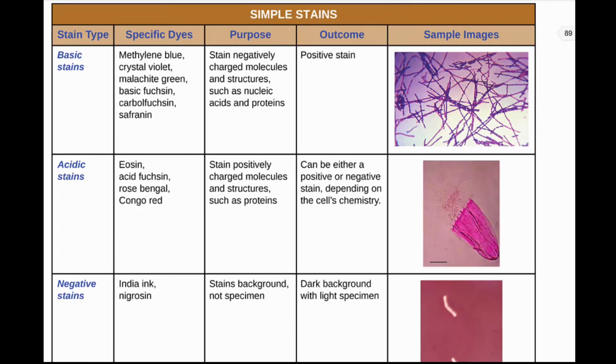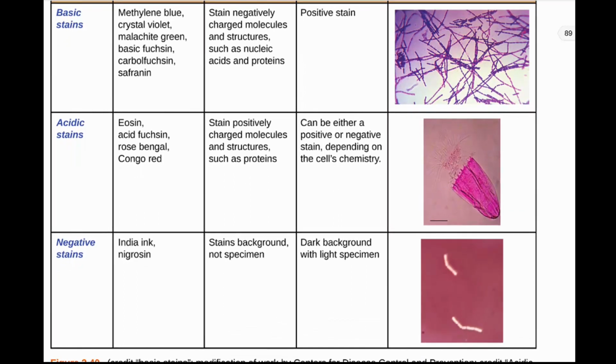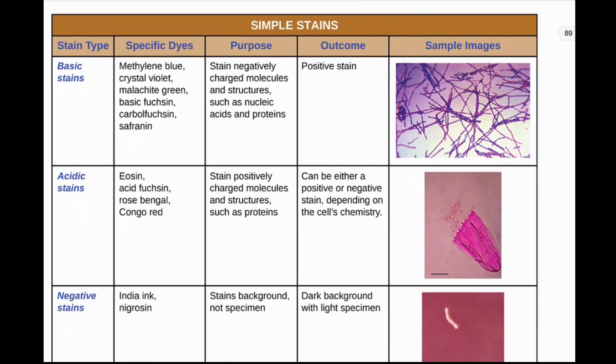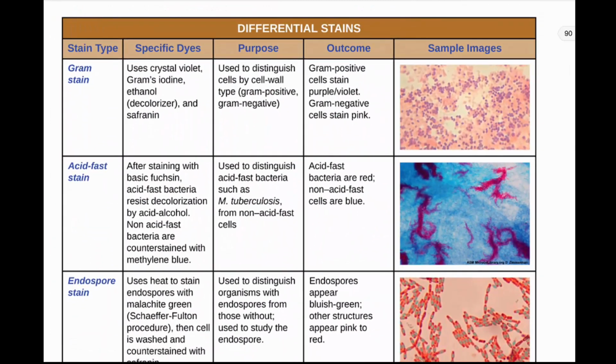So here's a breakdown of some of our staining techniques. We have our basic stains, acid stains, negative stains. These are some simple stains. Remember, a simple stain doesn't differentiate between different things, so we can just use these to stain everything on the slide. We can use a basic stain, an acidic stain, or a negative stain, or down here we can do differential stains. Remember, a differential stain is differentiating between different types of bacteria.